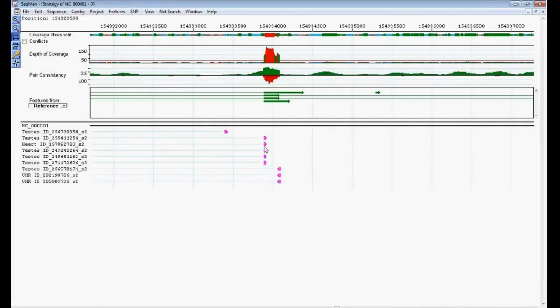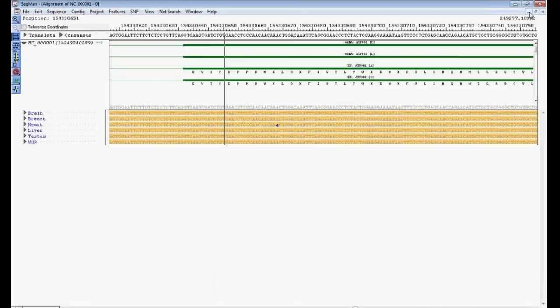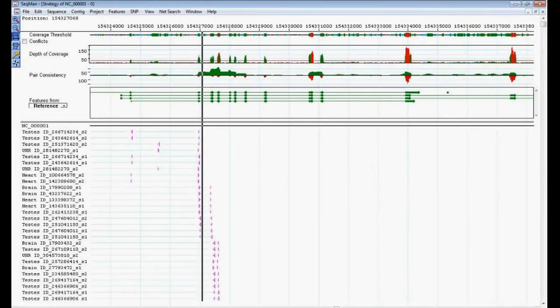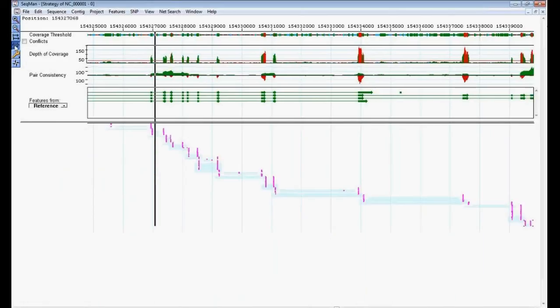we have these reads that are aligning right here, forward direction, and we have the reverse direction, and you can do that for other regions as well. You can click on any position and jump right to it in the alignment view by double-clicking, or you could just stay in this specific view. And as you scroll to your right, you can look at all the sequence names and the read information. I'm going to hide these sequence names so it's a little bit quicker that way, so you can get a better picture. Here's a quick summary of all the reads that are at that specific location.